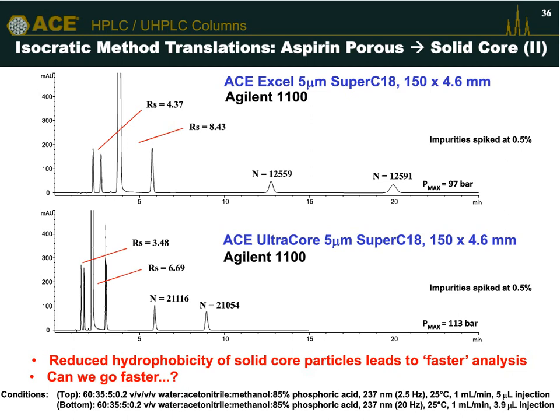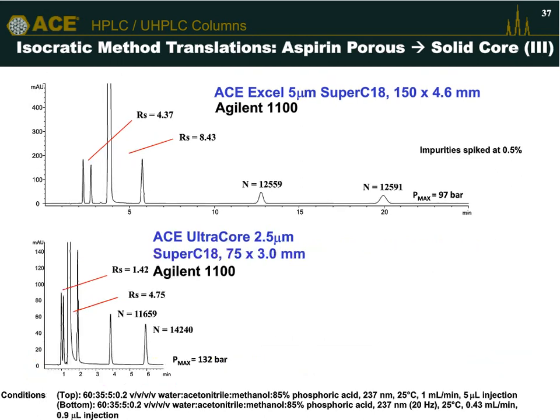Can we go faster? Of course we can. We can translate the method to shorter column dimensions. However, we hit a problem.